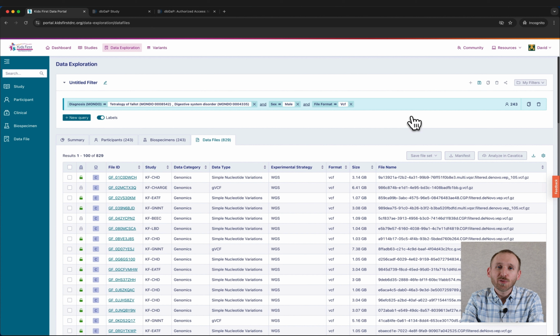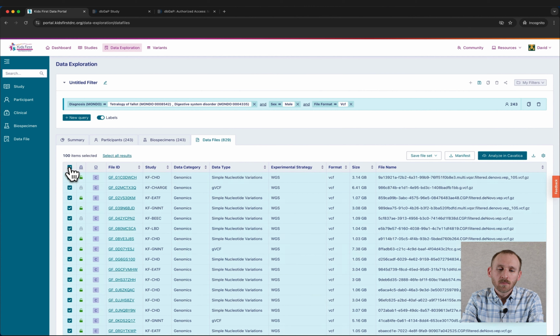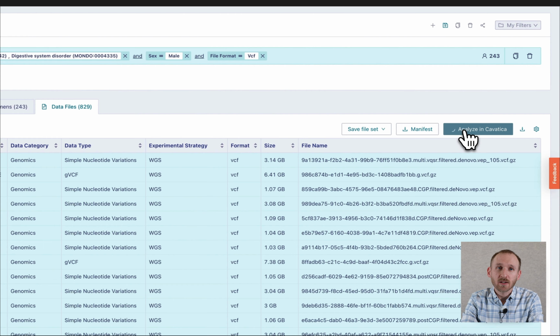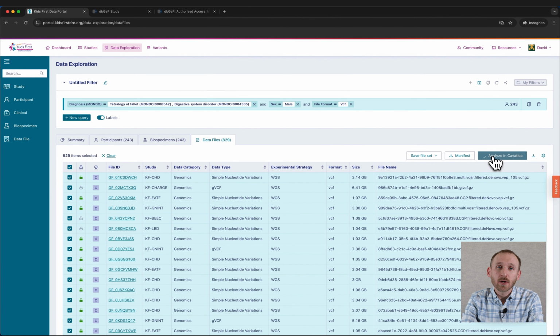Now we'll select the files we want to analyze further and choose the Analyze in CAVATICA button at the top of the table. If you're not sure how to connect your CAVATICA account, head over to video 4 in our user support video series to learn how to set up your account and create projects within the CAVATICA platform.